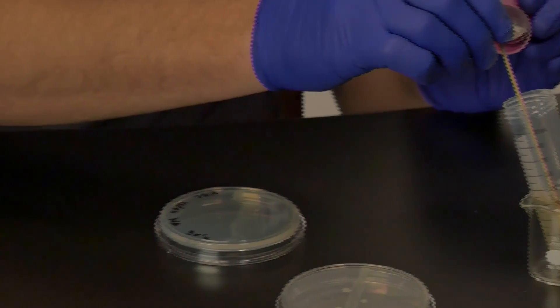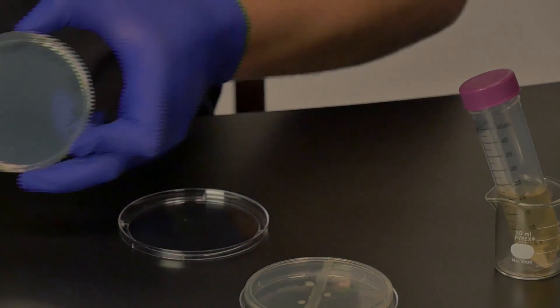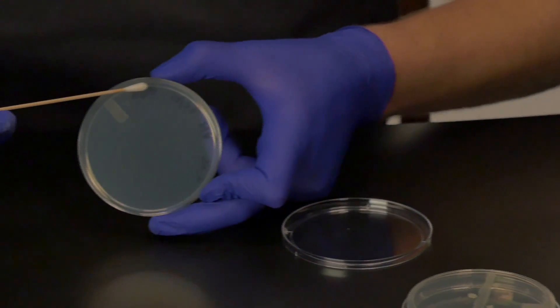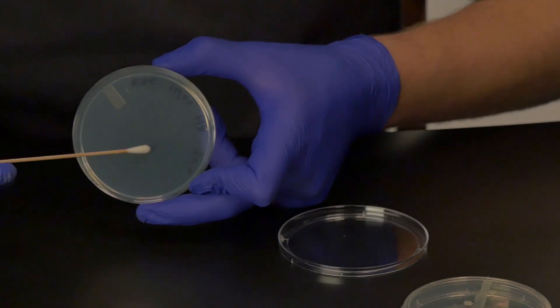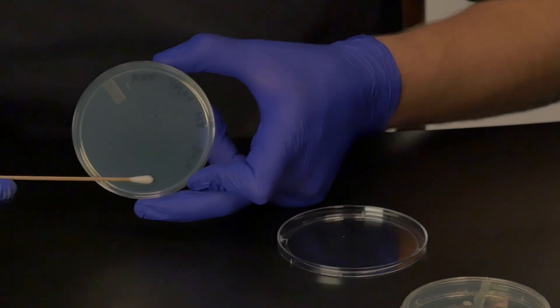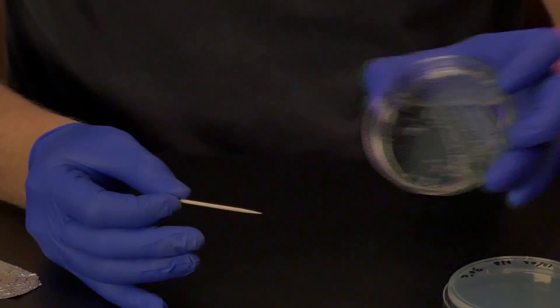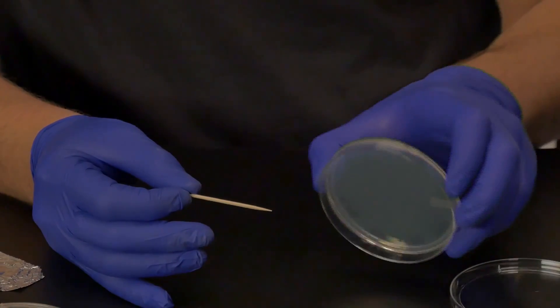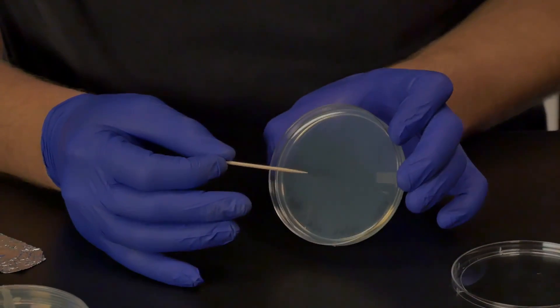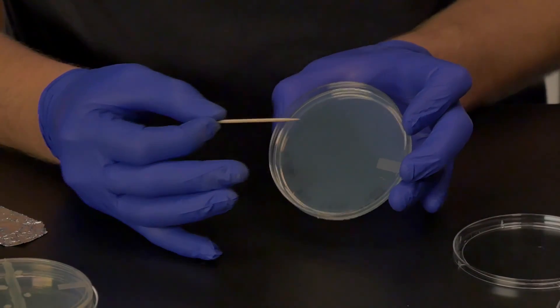Using a sterile swab, collect a sample of your escape pathogen and draw a straight line on the agar surface of the clean plate. Look closely so that you can see the edges of the line of pathogen. You will alternate your samples on either side of this line. Transfer some of the positive control and place it as close to the line of pathogen as possible. Then apply another sample of the positive control on the opposite side of this line and a little further down.